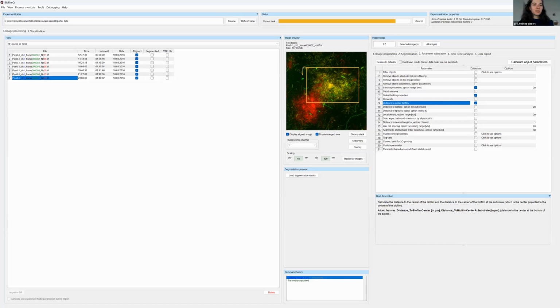Are there any questions to that part until now? Is there a rule of thumb in terms of when to apply Otsu or manual or any of the other thresholding segmentation methods?